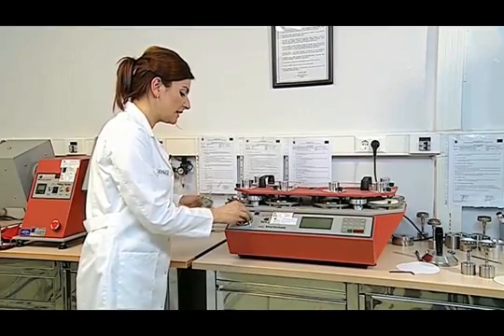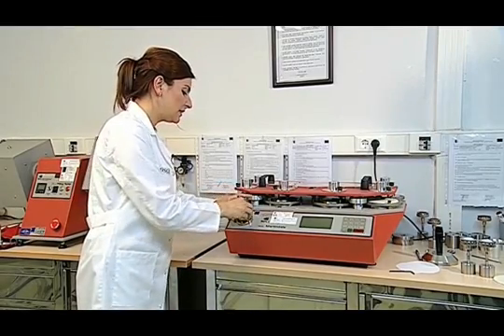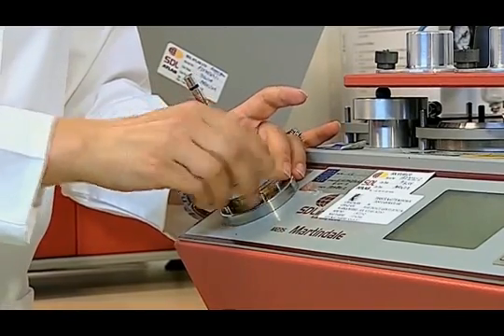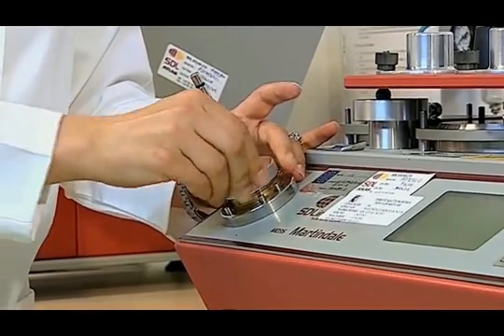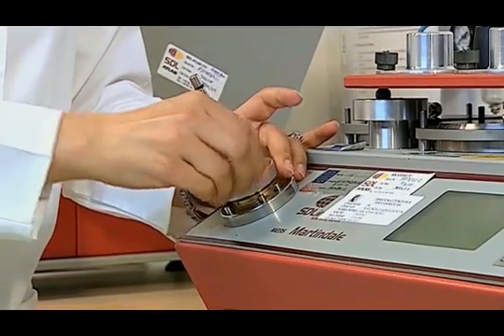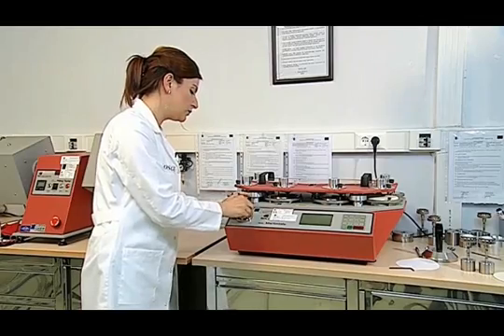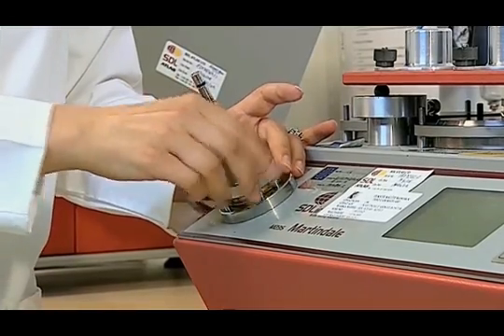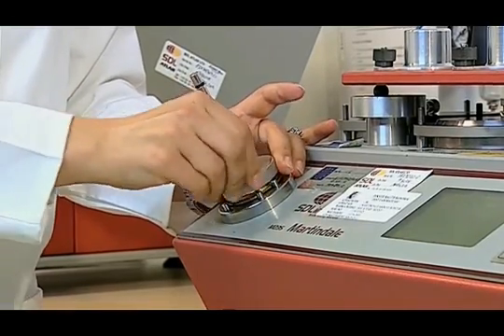The device is placed on the foam and the sample holder is compressed. In this way, three pieces of 38 mm diameter samples are firmly placed in the sample holder.